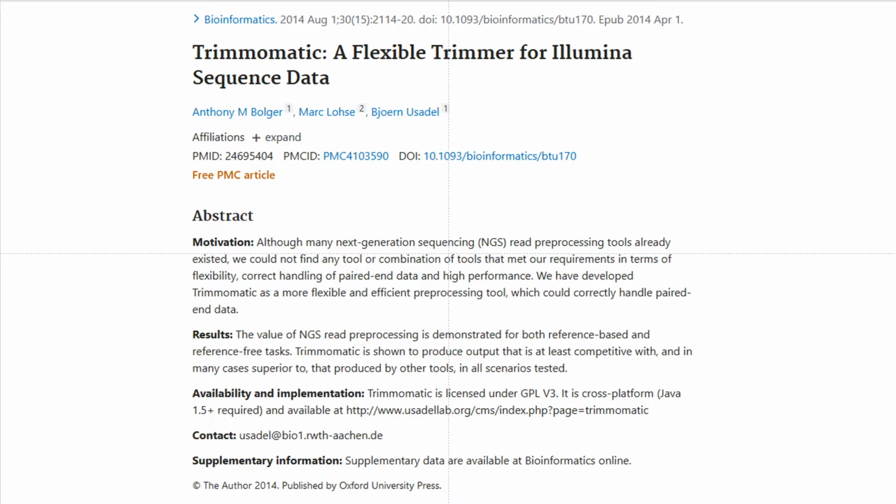And then I went on to do a workshop for bacterial genome sequencing. We provided the DNA for some bacteria that we thought might be novel. They had really low 16S sequence scores when we sent them in. And so we sent them in to get whole genome sequence, and I was part of that group. And we started using Trimmomatic, and that was reassured when I went on to do another course later on that did RNA, microbiome, and some genome sequence work too. And they were using Trimmomatic in that, and it was just another reaffirmation that this is a good tool.